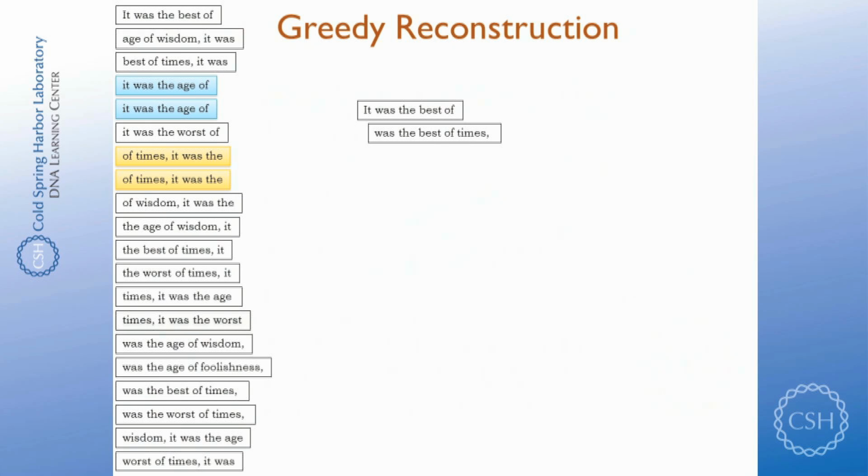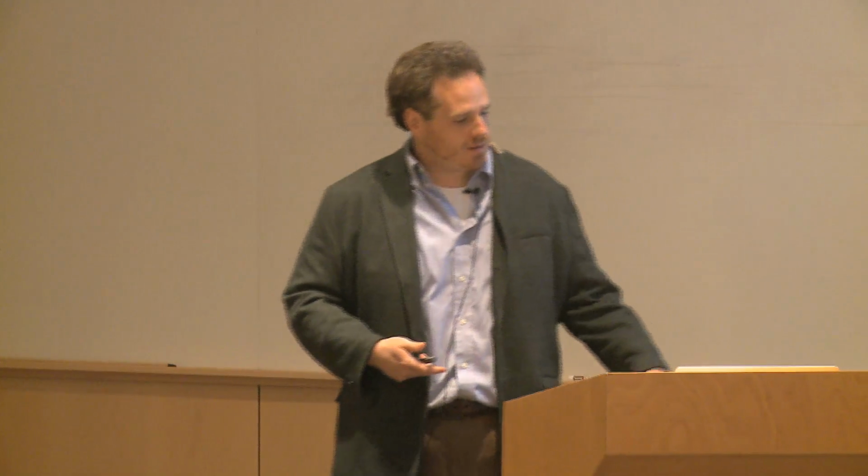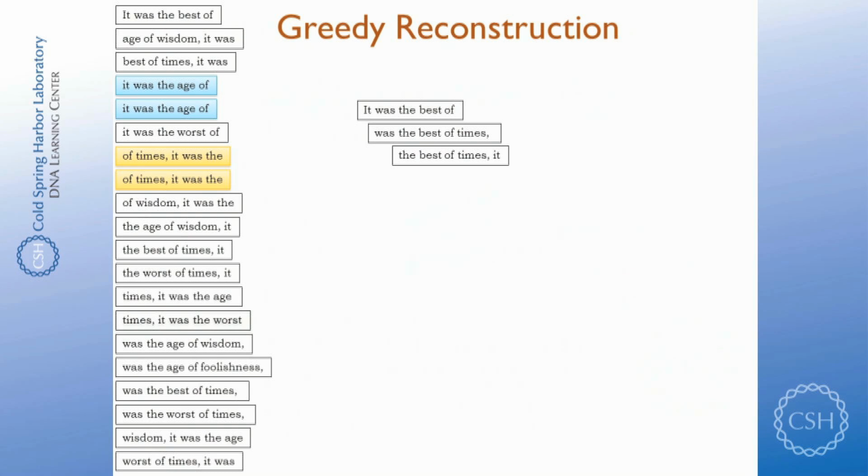That's good. This would be extremely tedious to do by hand with all these little pieces, but that's the sort of thing that computers are very good at, so we can very readily identify the next fragment by looking at these overlaps. OK, so we found 2 fragments. We can repeat, find the 3rd fragment, find the 4th. Everything is going well. The metaphor that I will sometimes use is, imagine you had a big bag of those little 4-block Lego bricks. If I had enough of them, I could build a bridge across the harbor, just piecing them all together. No problem whatsoever.